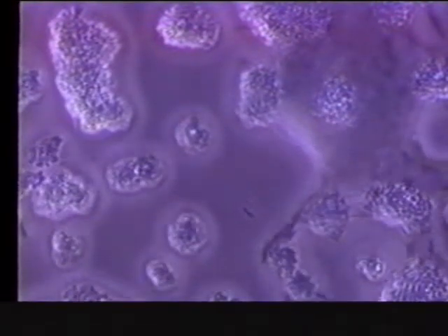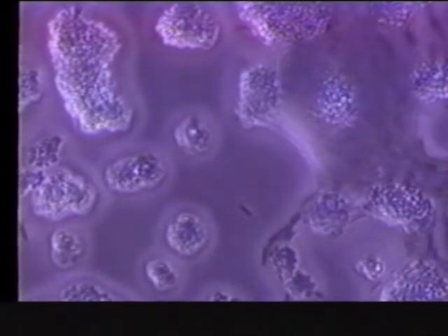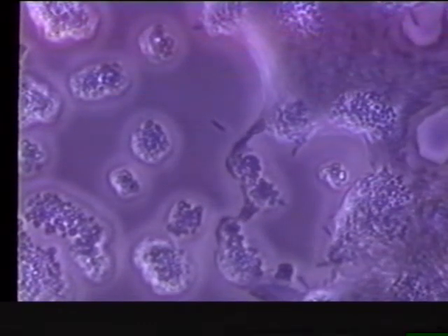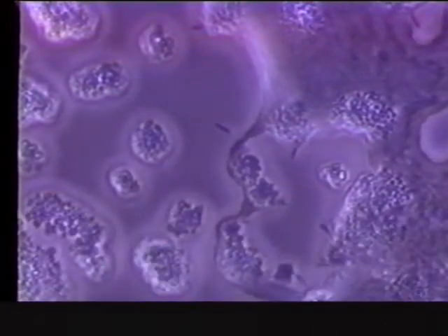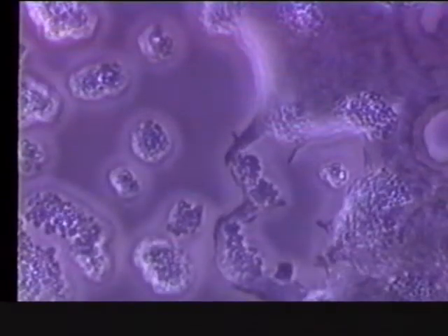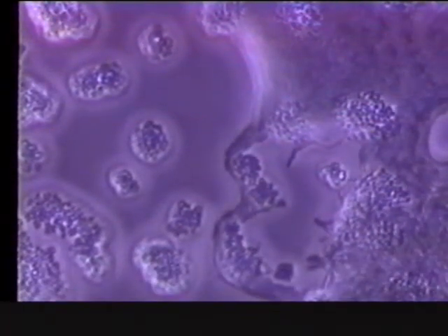It's been asked whether or not the cells are following some leader cell at the tip of the swarm, and this is a possibility, but there is no strong evidence for it as yet. When the Micrococcus lyses, then they become phase light. They're not dark or refractile anymore.